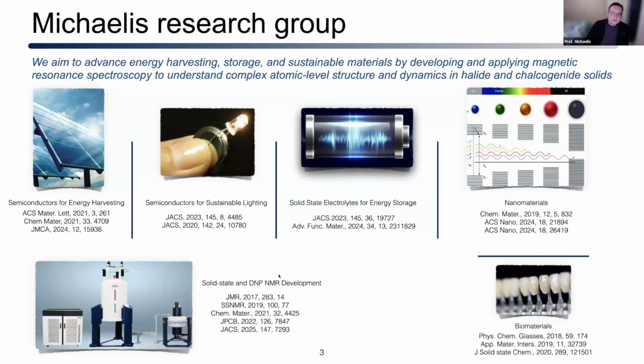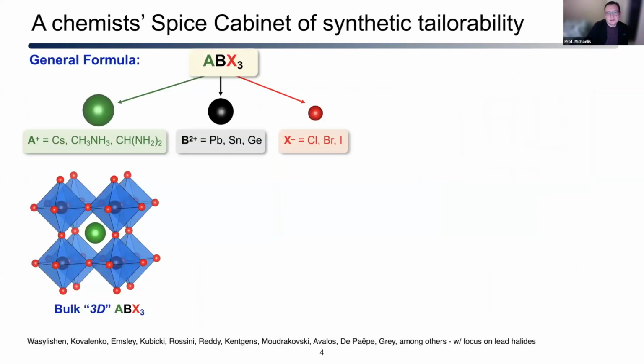And we, of course, as this is a global NMR talk, use NMR and DFT quite heavily to understand some of these finer structural aspects. What we're going to mainly focus on today is bulk semiconductors. We're not going to look much at alternative sources, but the key thing is these are typically identified as perovskite-like systems, and they're of interest for potential solar cell applications.